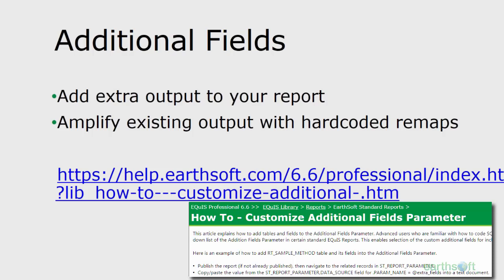This will allow you to actually apply remaps to the analytical results 2 report, which is something you can't do in the tabular interface. That grid is frozen. You can't actually edit anything in that grid. So that sort of gets around that problem as well. So if you want more information on that, we do have a good online documentation article with details on how you would actually set that up, including the data source information.